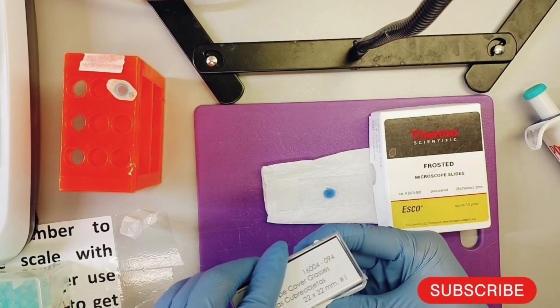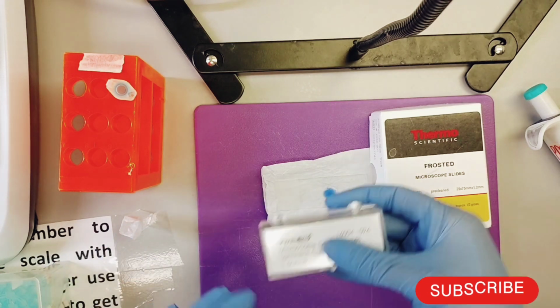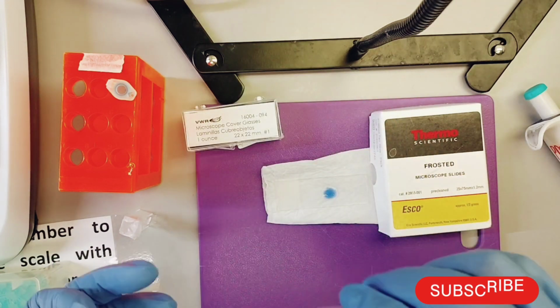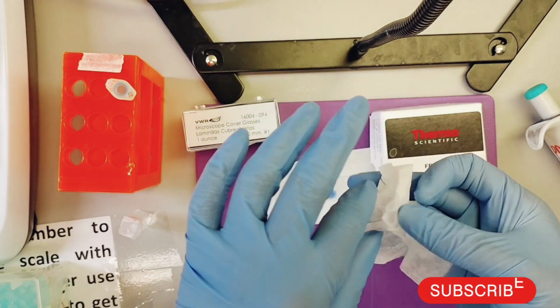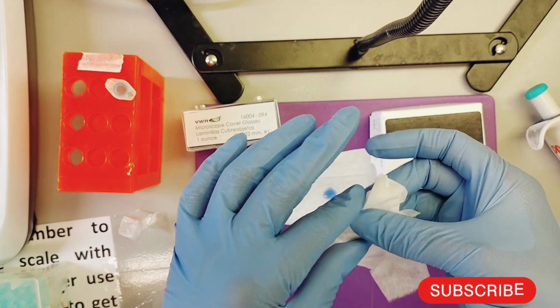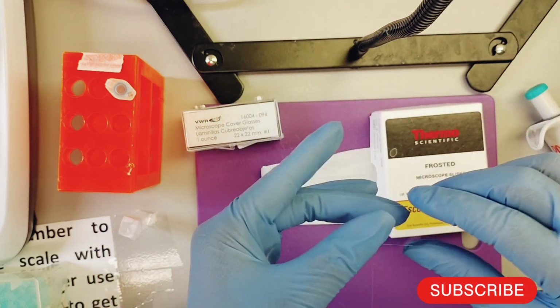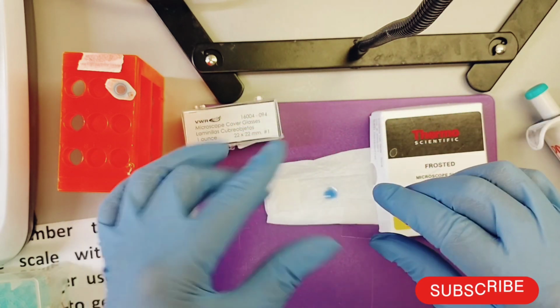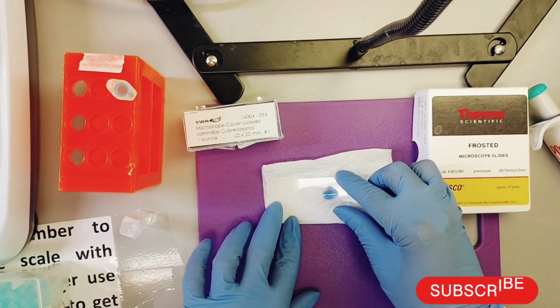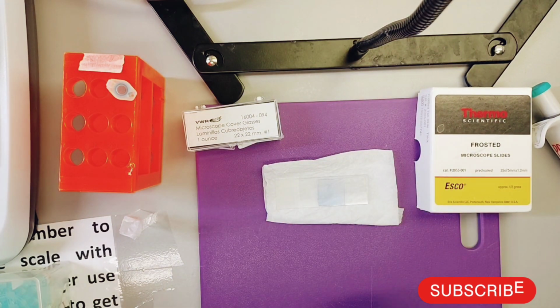and I'll add a cover slip because I'm going to throw away the slide once I'm done. I'm not going to pay attention to how I'm putting on the cover slip. I'm just checking to see that it's free from debris. There shouldn't be any fingerprints because I'm wearing gloves. Okay, the lens paper isn't smooth, so it leaves fuzz on it, and then I'll apply it like so, let it sit a bit, and then I go look at it under the microscope.